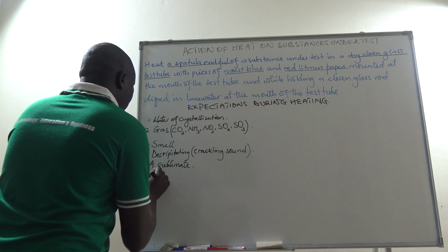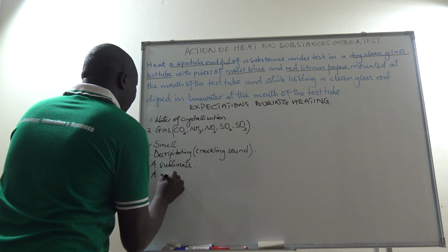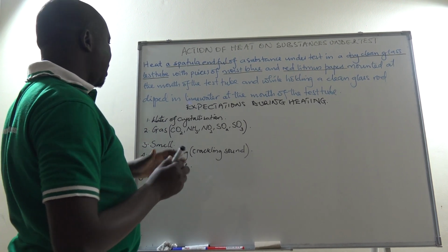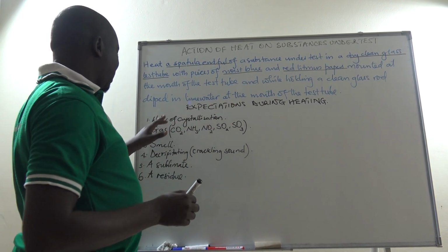We can now also get a residue. So we are going to look at all these here, what you expect during heating.